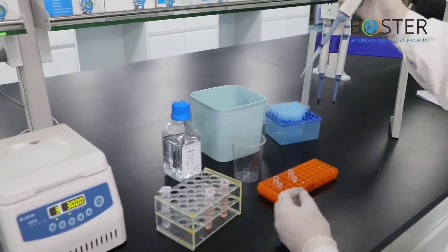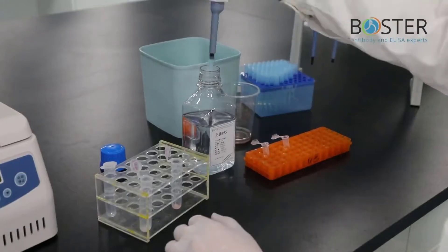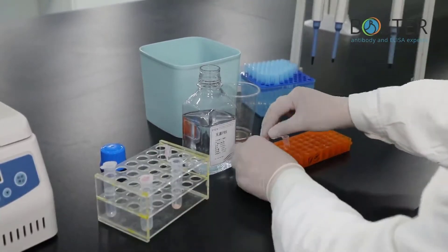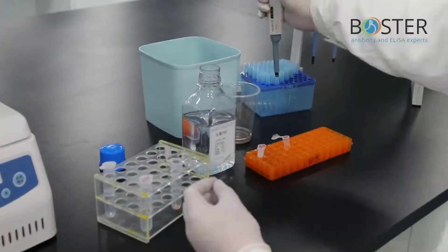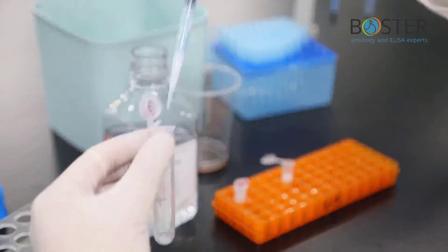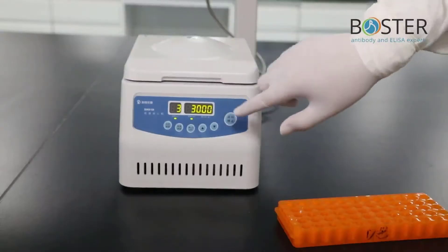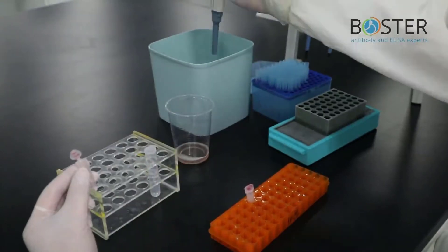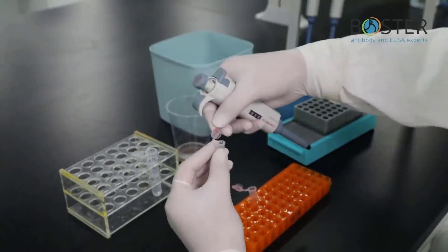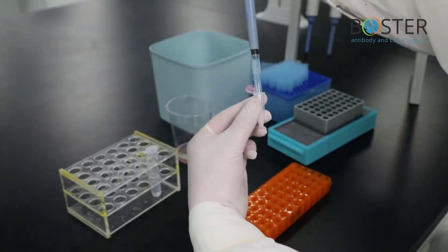Discard the culture medium. Add 1 mL of pre-chilled PBS wash solution and rinse twice. Transfer the washing solution containing the cells to the EP tube. Centrifuge at 3000 RPM for 3 minutes, then discard the washing solution. Add lysate at a ratio of 100 µL of lysate per 10 µL of cell pellets. Mix well, then lyse on ice for 30 to 60 minutes. Centrifuge at 10,000 RPM for 10 minutes.